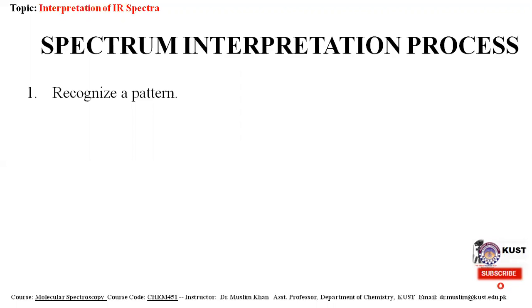First of all, recognize a pattern in an IR spectrum. Then associate this pattern, which we recognized in step number 1, with some physical parameter of the sample.